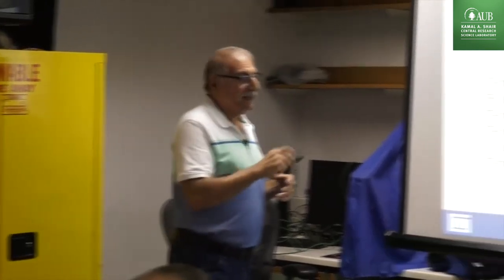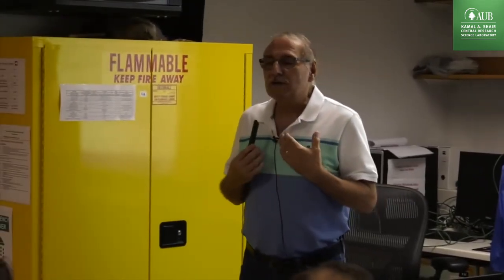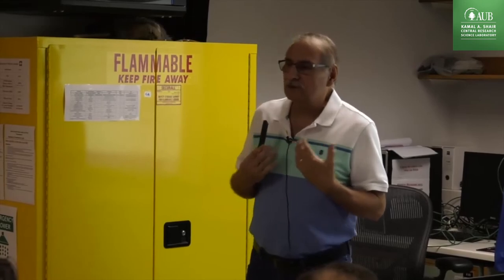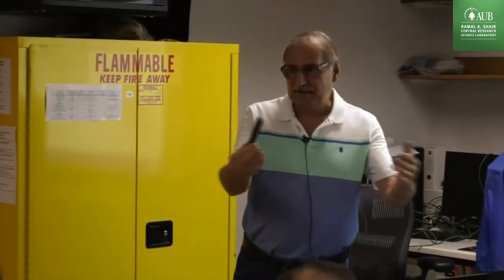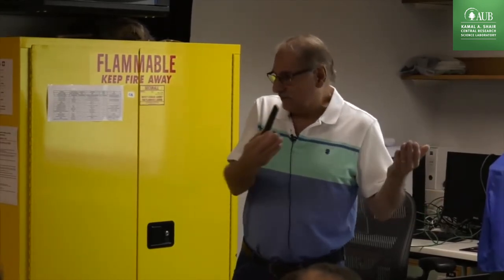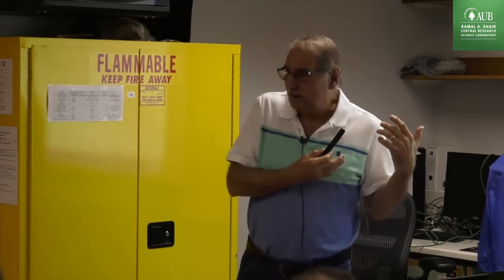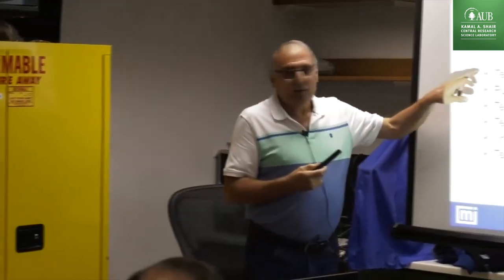The TPR is also going to give you information about how good your support is, the role of the support in your catalyst. What is the role of the support? It is to disperse the active species and to stabilize them when you go to higher temperature. This is the role of the support. So the only way you can tell if the support is good or bad is to do TPR.